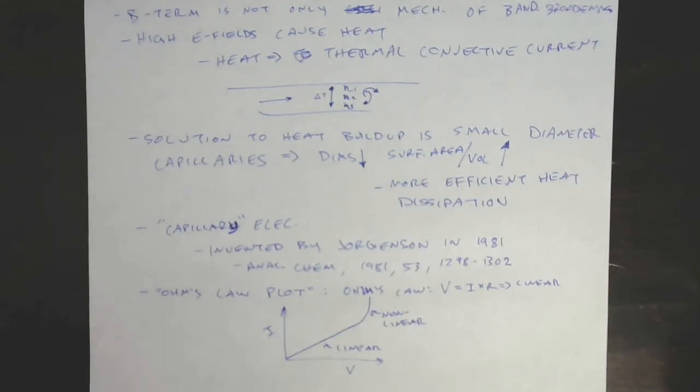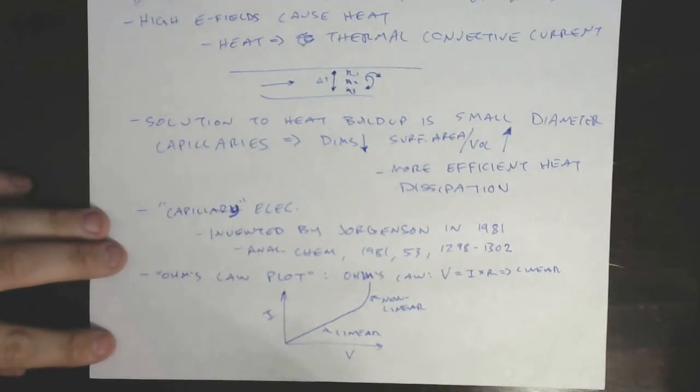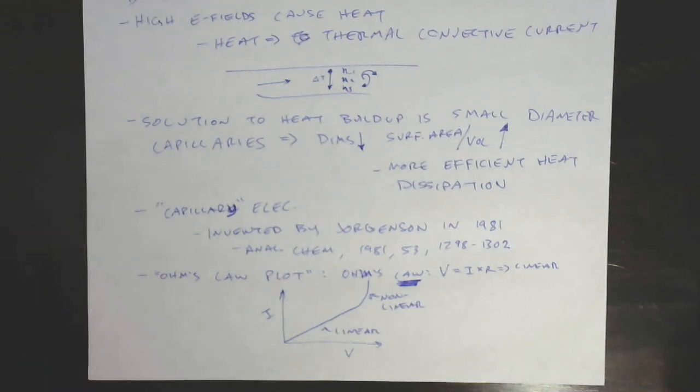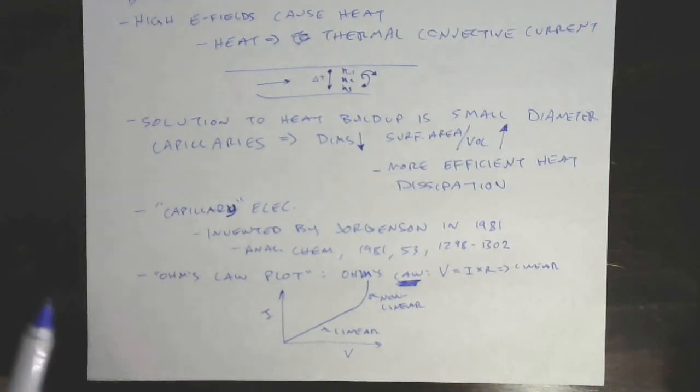But the thing I want to point out, which drives me absolutely nuts, is people say, well, we measure this until it stops following Ohm's law. It kills me. It drives me nuts because Ohm's law isn't called Ohm's strongly worded suggestion. It's called Ohm's law. Nothing ever stops following a law. What happens is the properties of your system change. It continues to follow this law of nature. It just happens to no longer have the properties you thought it did back here. I know it sounds nitpicky, but it's something we should be mindful of if we find ourselves working in this area.